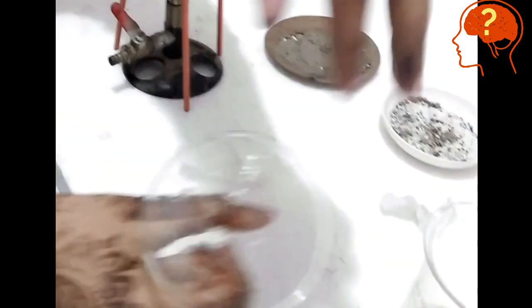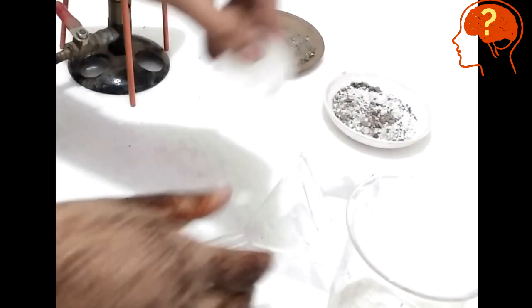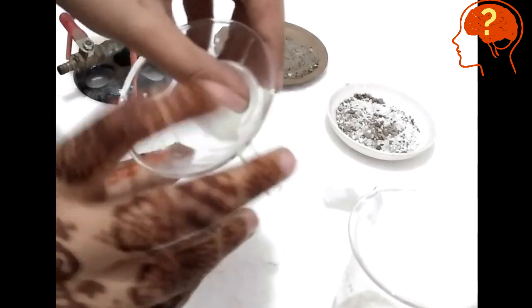Now moisten the funnel with water and make the cone of the filter paper and place that cone inside the funnel.